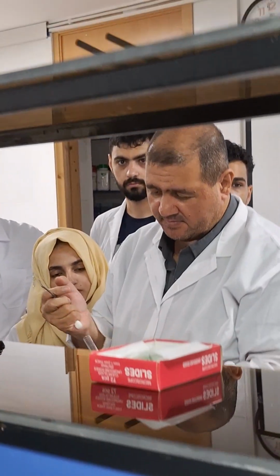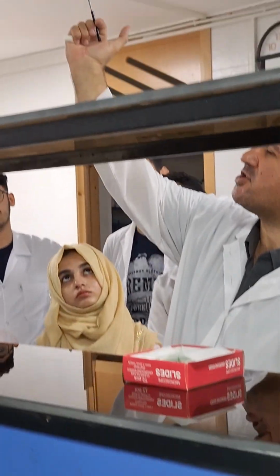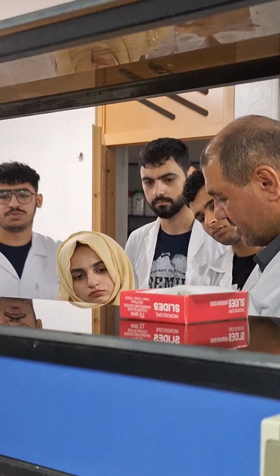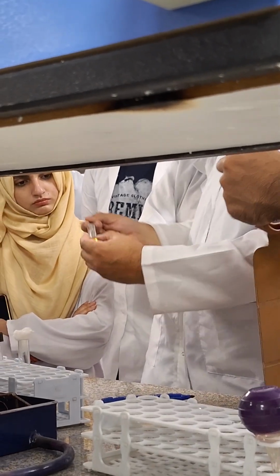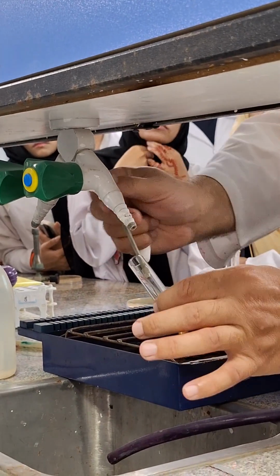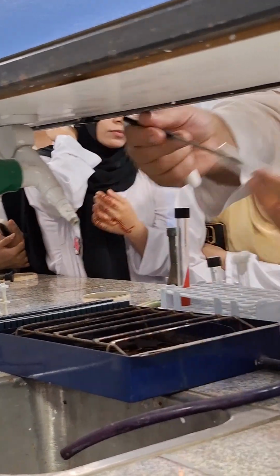We should use another. Remove the tissue, don't place it on the bench, pay attention here, hold the tissue and cap in your hand. Sterilize the neck of the tube, tilt it, and insert bacteria in the medium and mix it. You understand? No, this one.